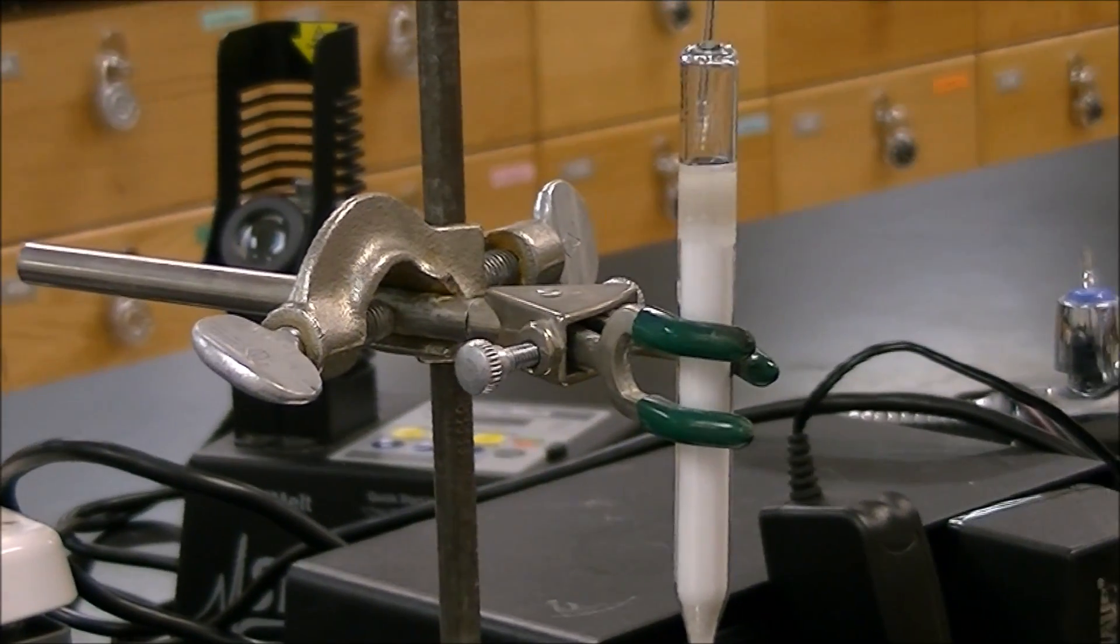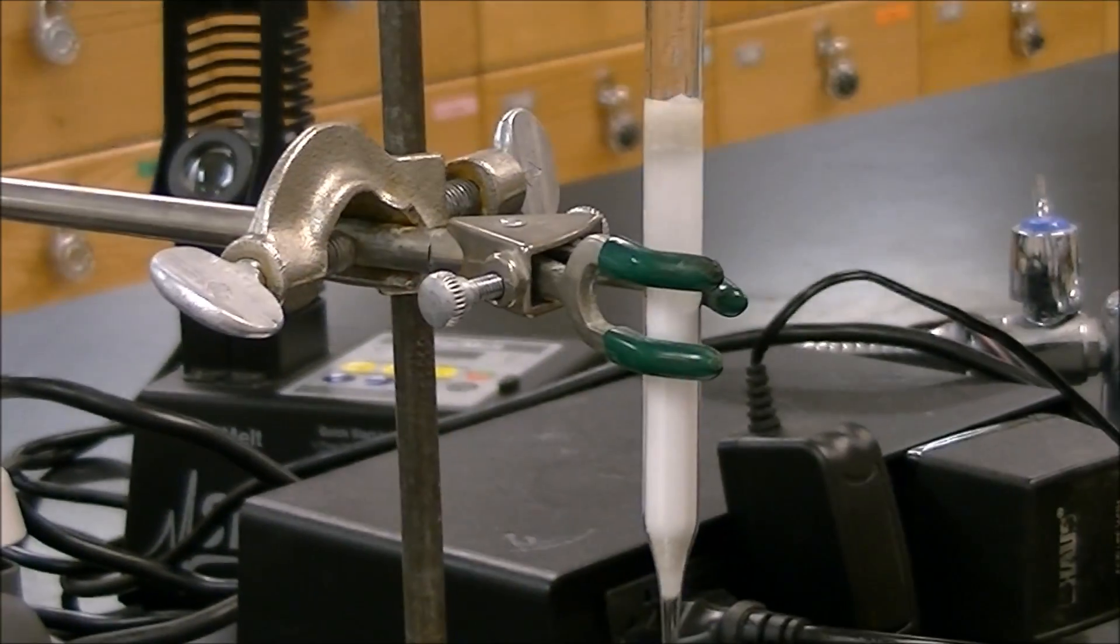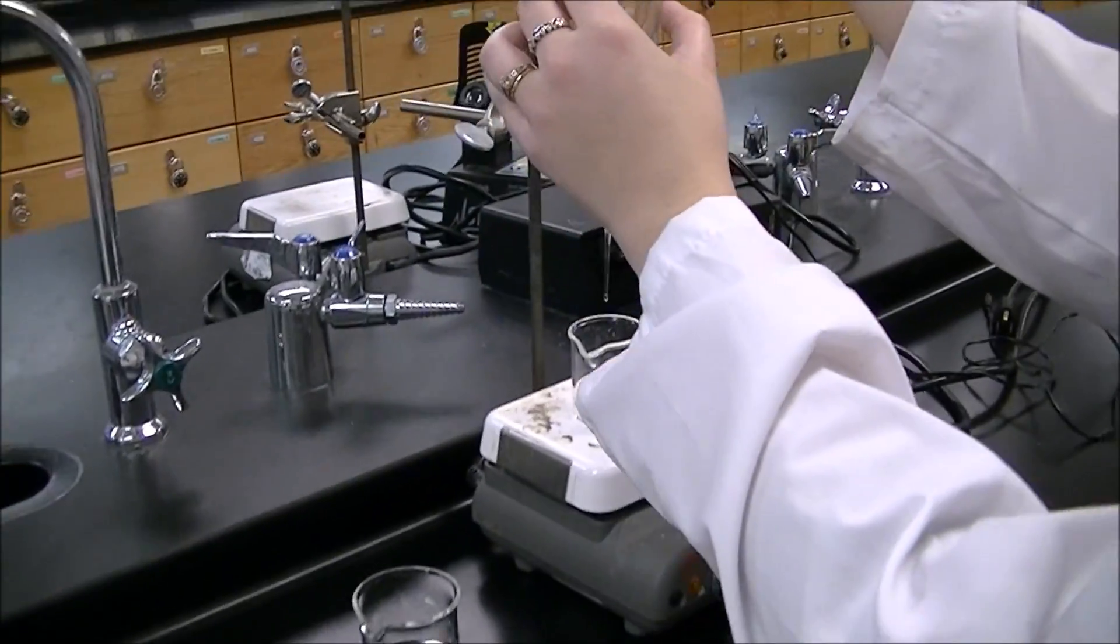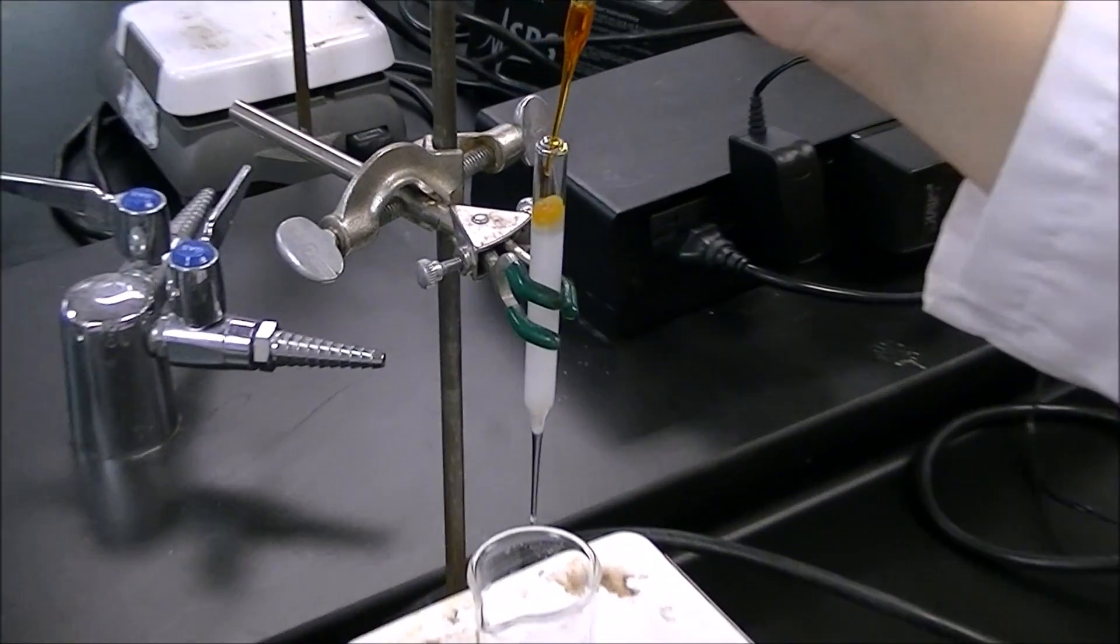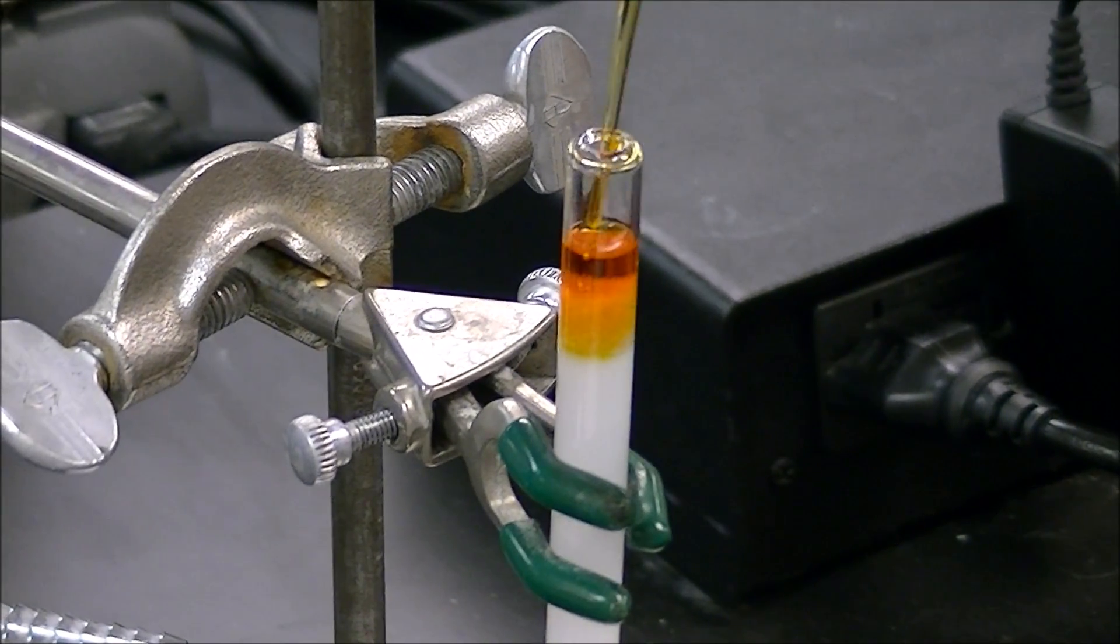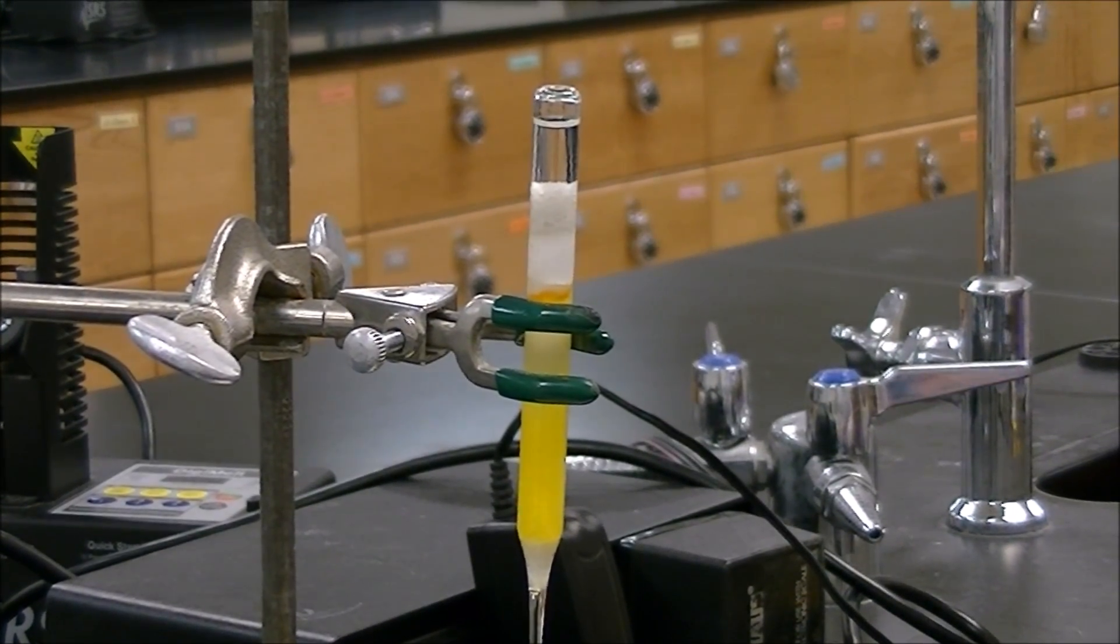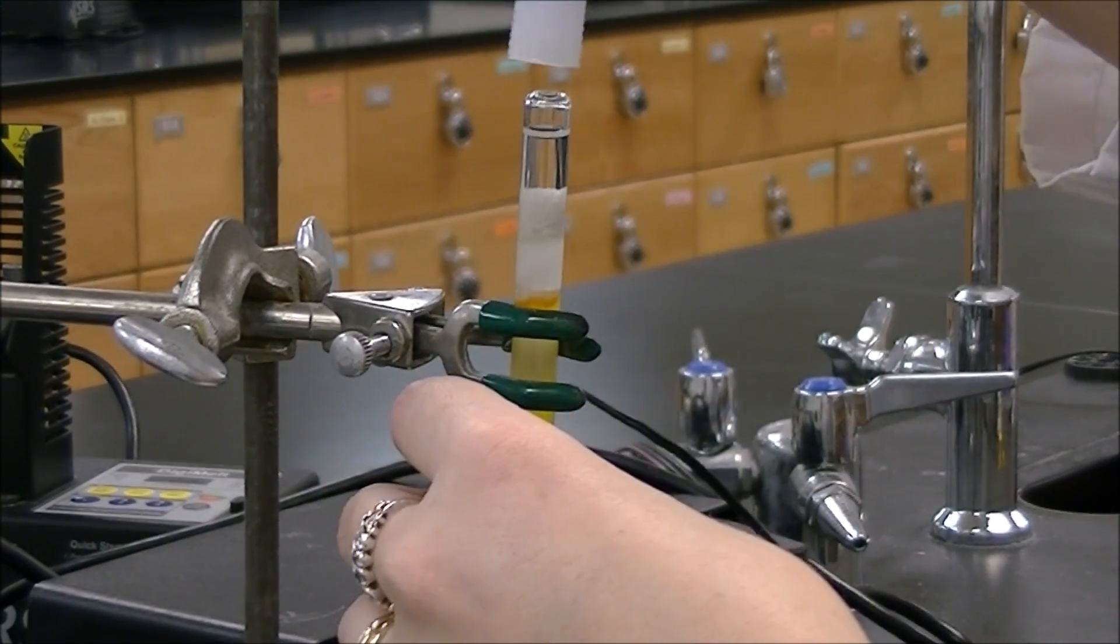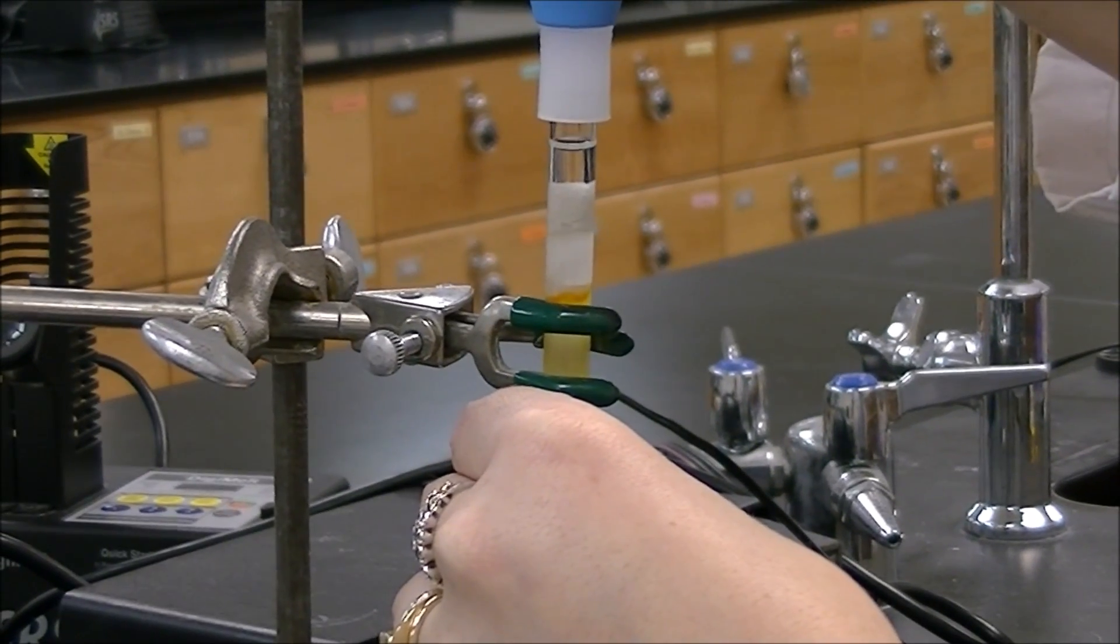We need to wet the column before we can run the separation. You do this by completely saturating the column with your solvent. Now add your sample as evenly as possible to the column. The mixture will begin to separate as you continue to add solvent to the column. Once the sample has traveled completely onto the silica gel, you can use a bulb to push each portion of solvent through the column faster.